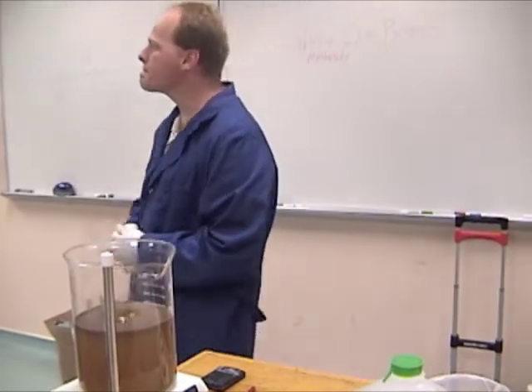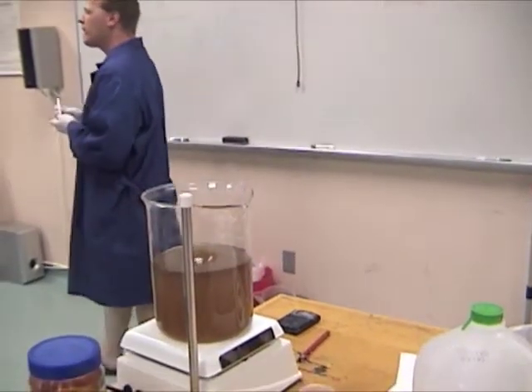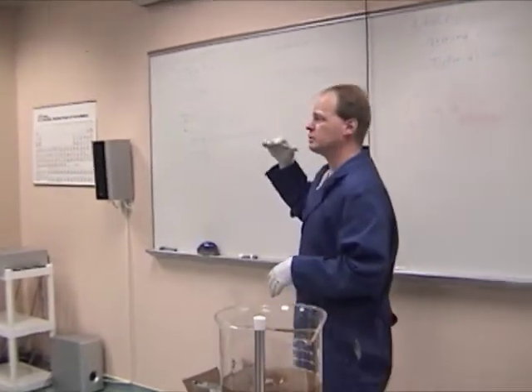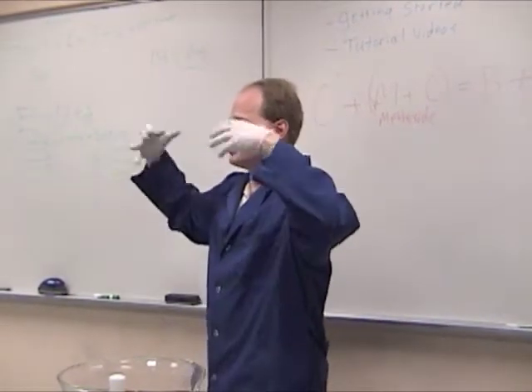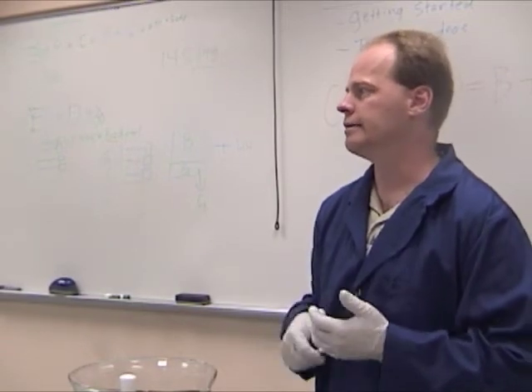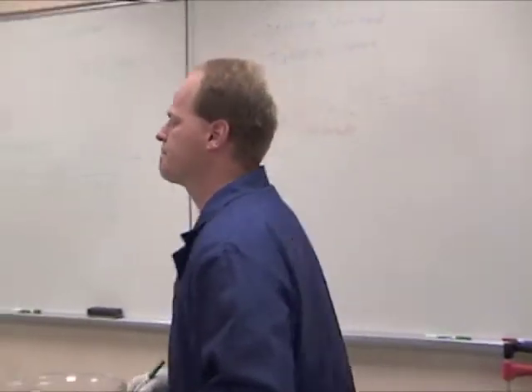Now you wouldn't want to go higher in the temperature because that starts to boil off the methanol? Yeah. That is. Well, methanol boils, they tell me, at about 148 degrees Fahrenheit, but it depends on your elevation. We're sitting at a mile high, so it's going to boil at a little bit less than that because the barometric pressure in this area is lower. So it'll boil right off. But generally about 130 to 135 is where I like to take it. So we're going to let this just kind of mix for a minute, and while that's doing it, we're going to talk about titrations. That's our next step.